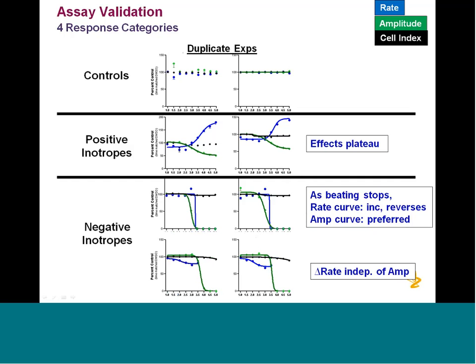The other major group of negative inotropes had the following profile. Amplitudes went down until it stopped, but you can see here in replicate experiments, and again, I would point out there are error bars on all of these from 3 wells. You know, we're probably going to change to, just for cost and ease, duplicate wells instead of triplicate, because we've got overkill on this data.